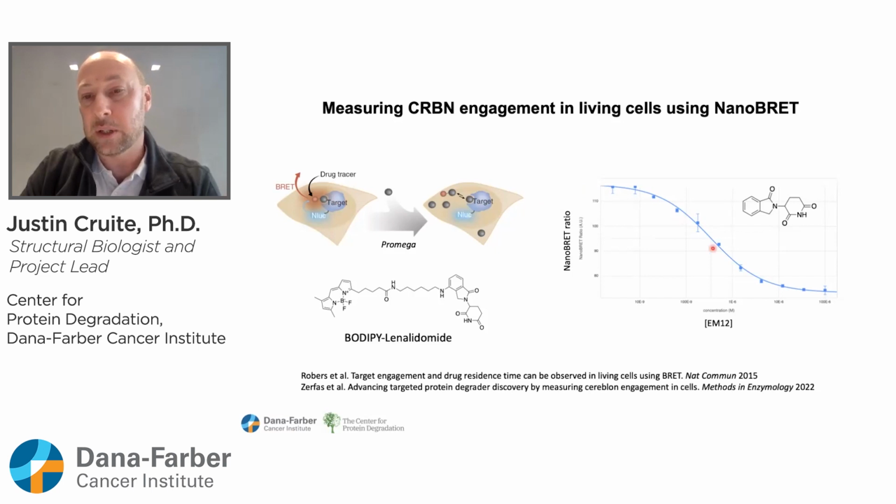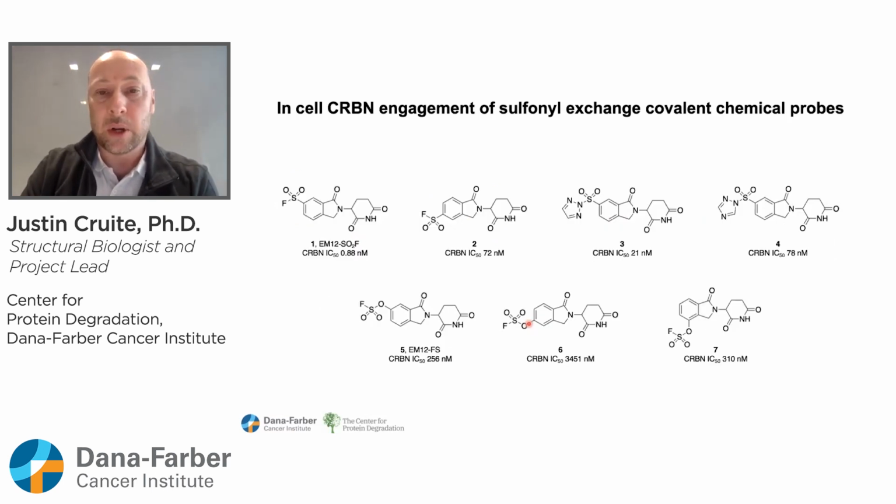And as we increase the concentration of a competitor molecule, shown here, such as EM12 control, we see a decrease in that BRET signal. And so we ran all of our covalent probes through this assay and confirmed that they do displace the lenalidomide probe, confirming that they do bind the imid binding pocket in cereblon in live cells.